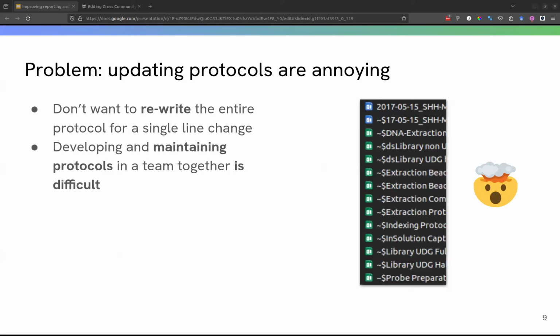We do have Google Docs, Google Drive, and things like this, but often people fall back to things like Excel sheets. And if you're working on this together, you can get horrible messes like this, where you've got a common single file, which is your protocol, but then 20 people open it, they have lock files, they make changes, they don't save it properly. Someone goes and tries to clean this up, and they delete the entire directory. Your entire protocol record is gone. It's also really bad. So again, with this arguably archaic form of writing, things like Excel documents do not match the way we work today.